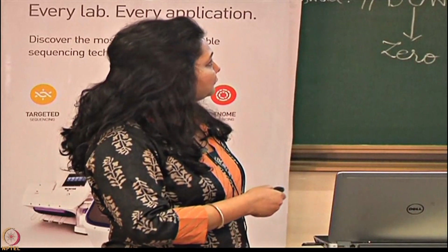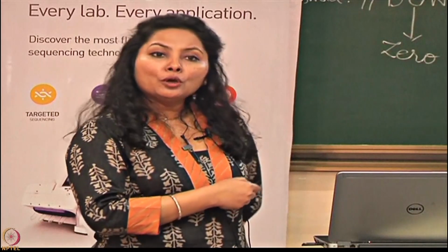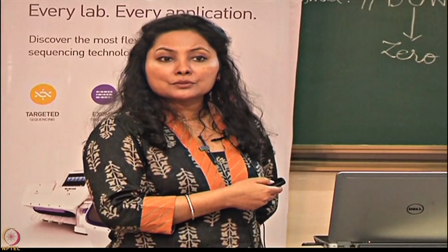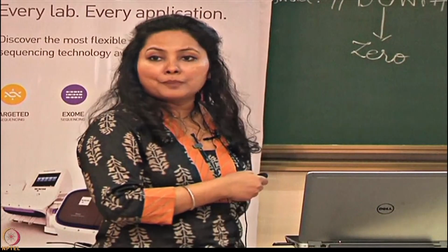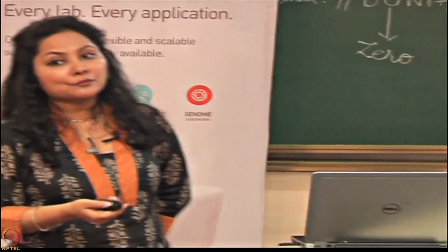So once you have ligated these adapters, you pool all these libraries. You might be working with probably 6 samples on a chip, so based on the number of samples you plan to multiplex on a chip, you are going to use that number of barcodes. Once you've done that, you want equal amount of data for all those libraries. In terms of their molarity, you will use equal molar concentration for all those libraries and make one pool of that.